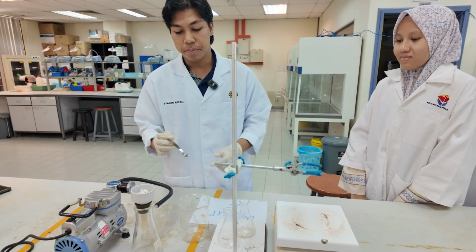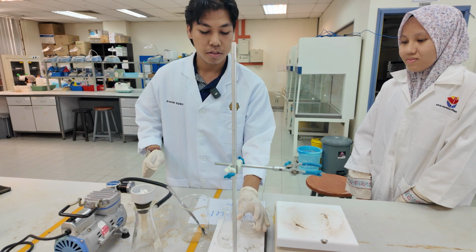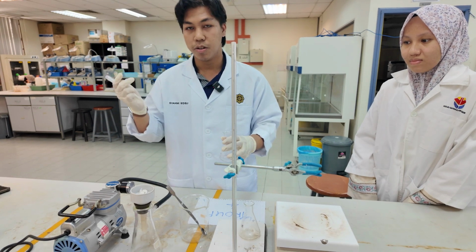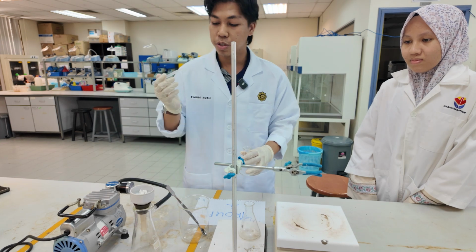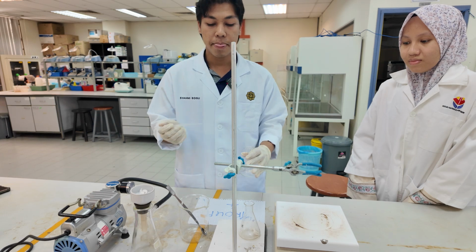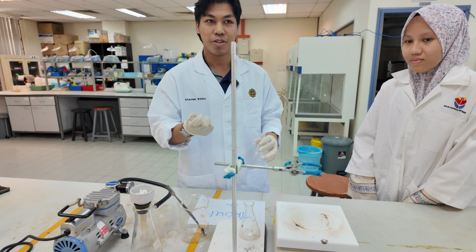And then we need to add to the mixture flask. Wrong flask, sorry. For the mixture flask, we have to add 2 things, which are water and methanol. Make sure you use the dropper to put the methanol. Do you guys remember the measuring cylinder?